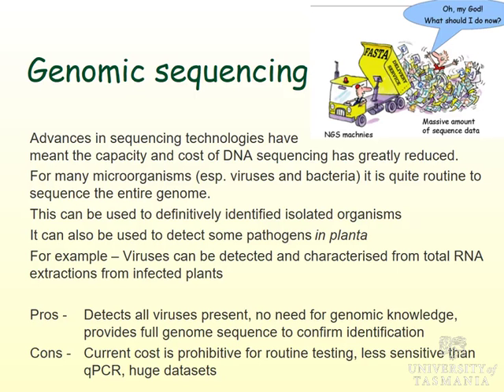So if you look at the literature now, we're getting hundreds and hundreds of papers coming out where people are discovering brand new viruses because they're testing samples and these genomes are popping out that no one ever knew to look for before, but they're finding them. That can be really useful, again, for a sample that you know nothing about. You don't need to know primers, you don't need to have antibodies. It can be no information whatsoever, and you'll get the result. It can also be valuable for doing large-scale surveys.